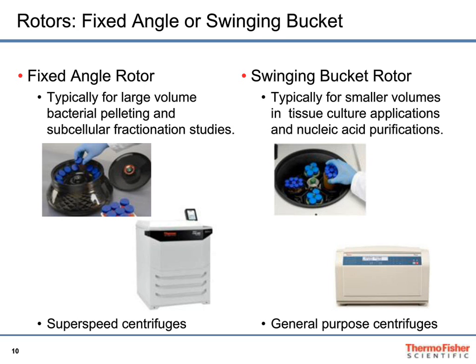So again, if you're looking at buying new anytime soon, it may be that you have two centrifuges that are old. It could easily be these days with some of the innovations that have come on that you can put both of those aside and replace with just one unit, and maybe mix and match some of the rotor capabilities that would be available to you.